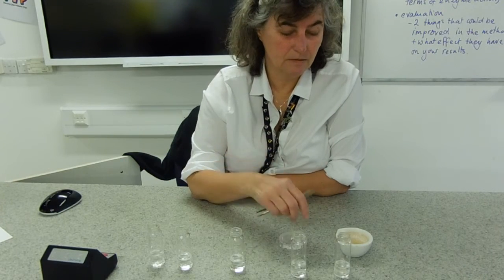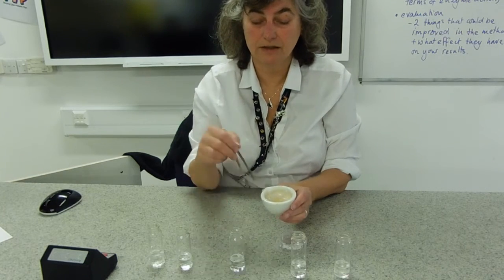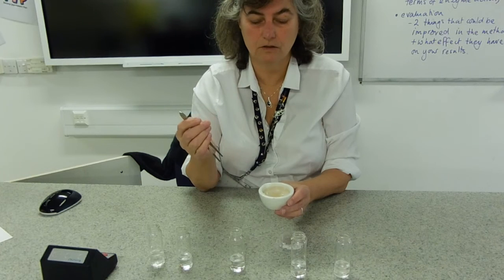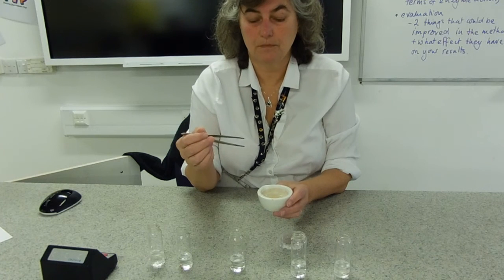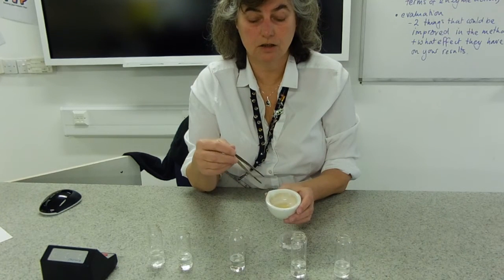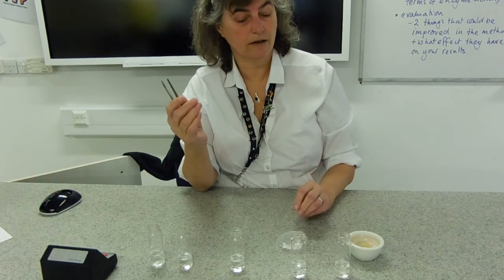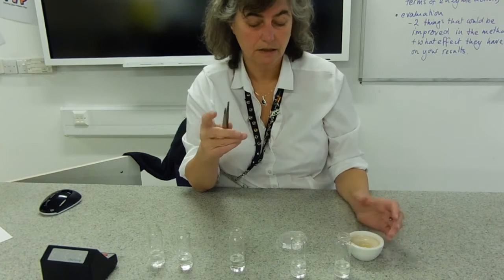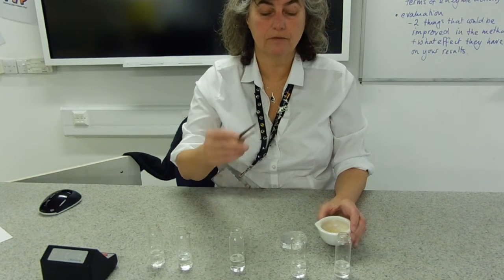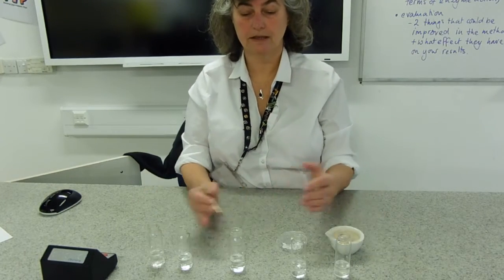Other issues with this experiment: we don't know the concentration of the enzyme. It is a protein — it's quite heavy and tends to settle to the bottom, so you should stir between each reading; if you didn't do that, that's an improvement you could make. We could use a powder to make a known concentration of enzyme solution rather than using tissue, which might yield more accurate results. Also, if there's a bit of potato on the chad it will weigh it down and make your time a lot longer.